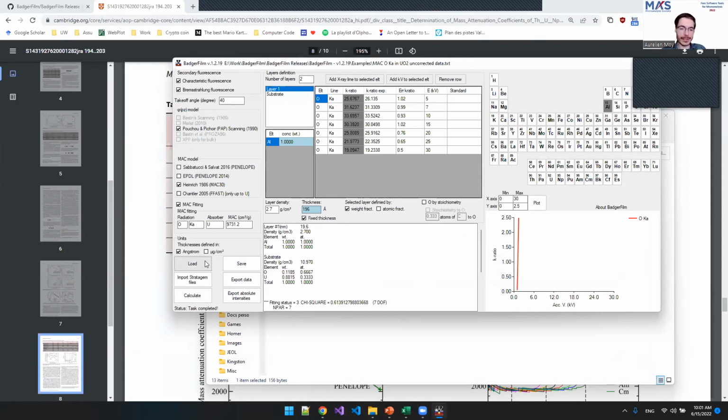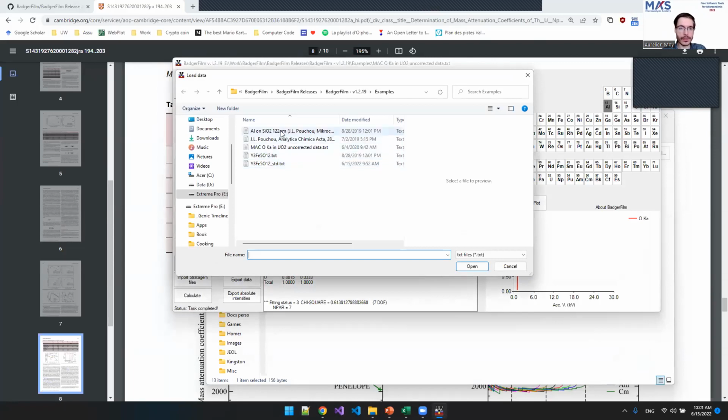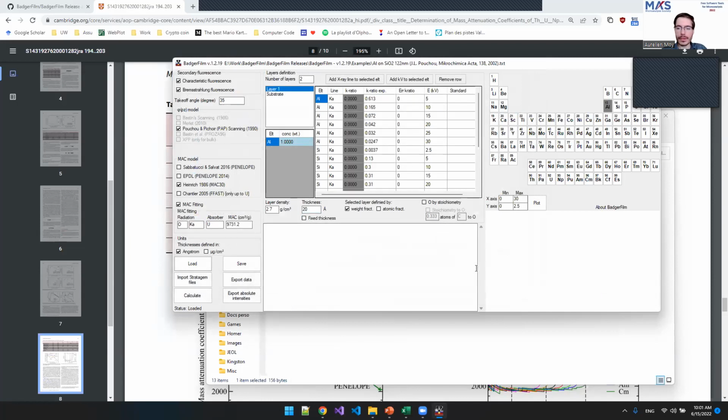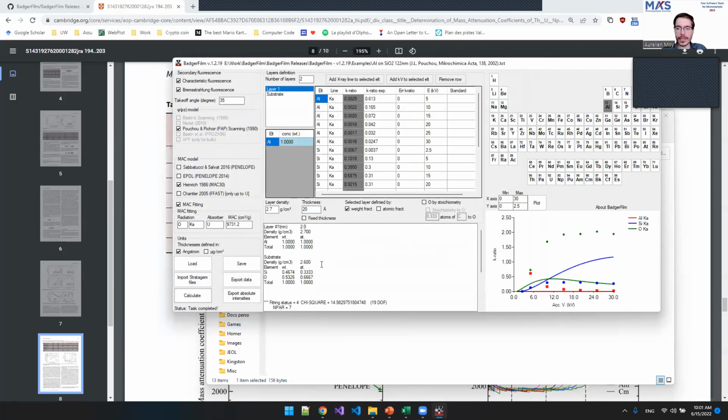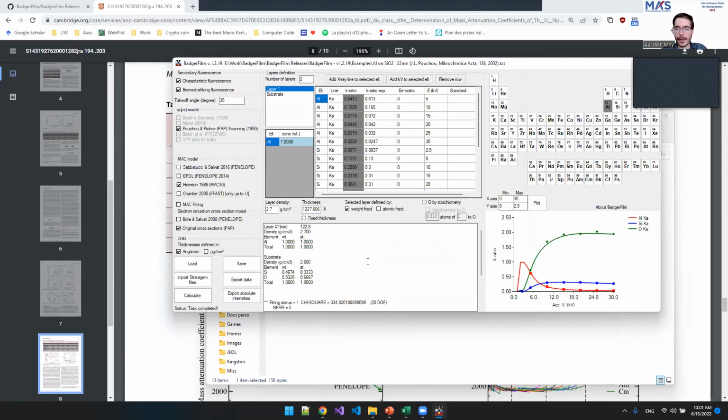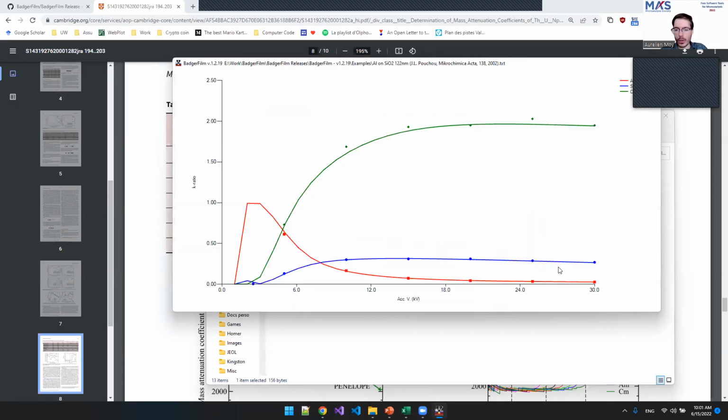Okay, the best, maybe I can show you if I load this, try to calculate it real quick. I did something wrong. Oh, yes. The best is having K ratios where the curve is curving, actually.